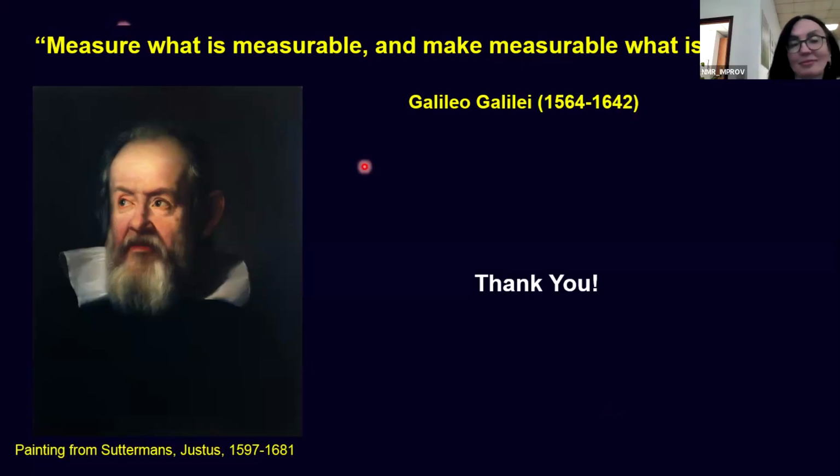So what I can say in answer to your point is that in low dimensionality, it's reasonable that the commonly used fitting engines will work quite well. We have tested this in other models, not only in this one. For example, in nematic liquid crystal.